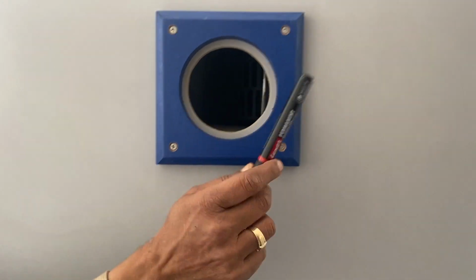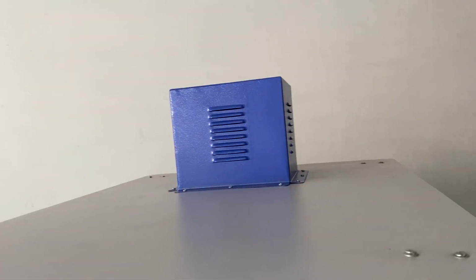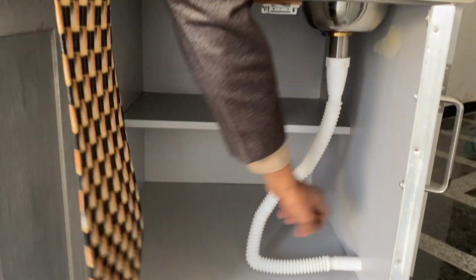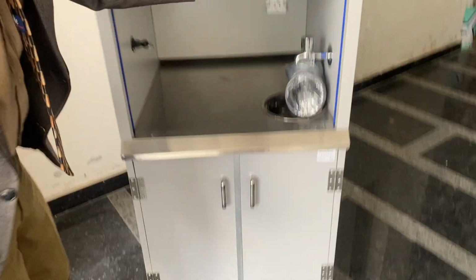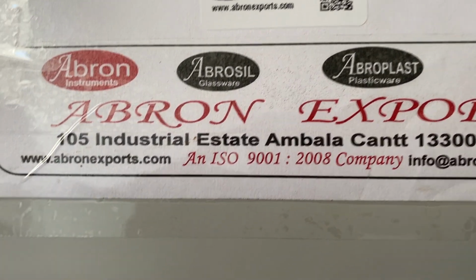Inside you see some exhaust. You connect it to the outside, and on the top side there is a soundless motor. On the right side there is one point for connection to the LPG gas, and below is a cabinet where you have to connect the output to the drainage so that you can put it outside and store some of the things required.